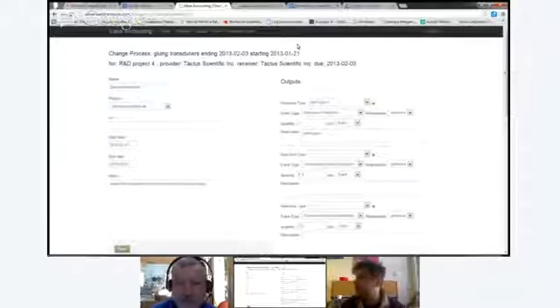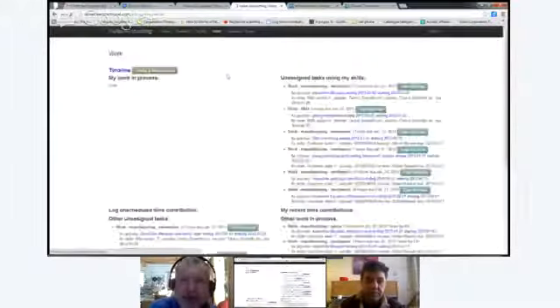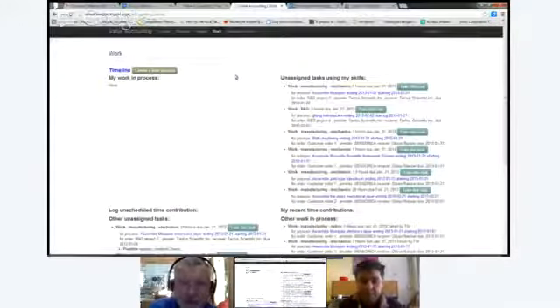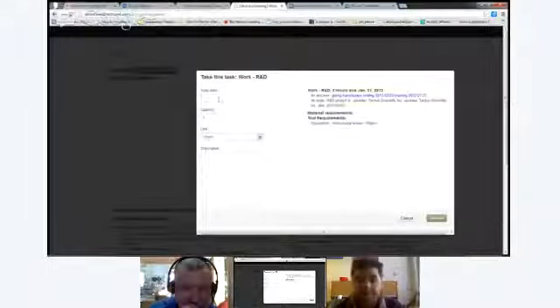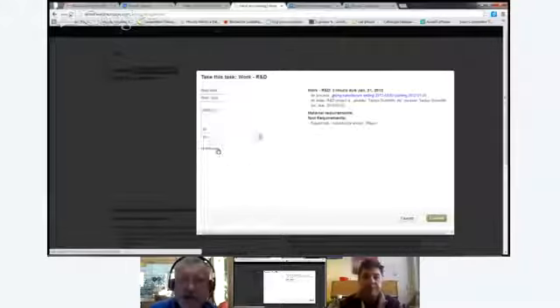So let's say now if you take it, now it opens a lab book, right? If you take it, then that will say that you're going to take that, and then it will show up in your work in process. Okay, can we do that experiment? Yeah. Okay, so now Francois takes it. So you commit to that task, right? Yeah. I'm just trying to translate it for the people that will watch the video later. This is when you're actually going to start it.